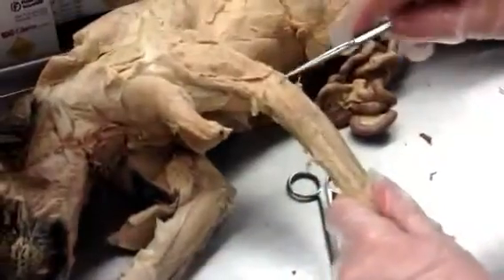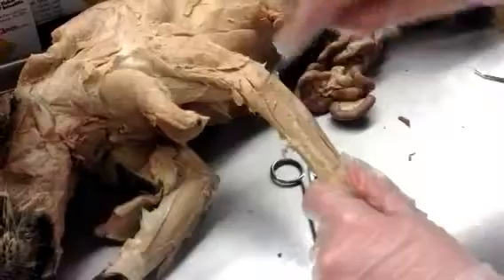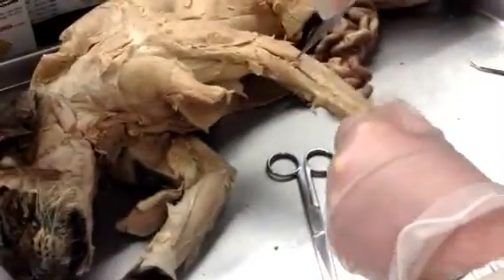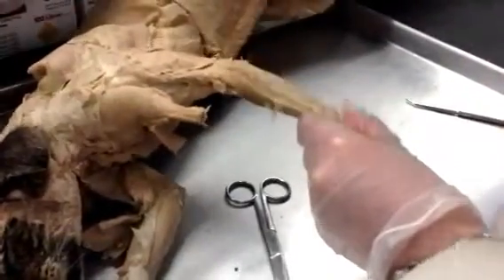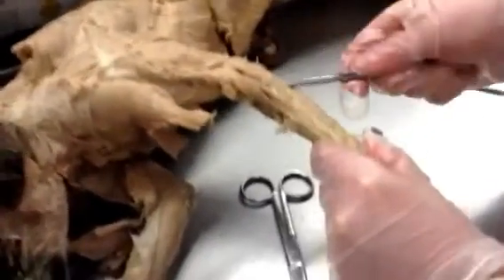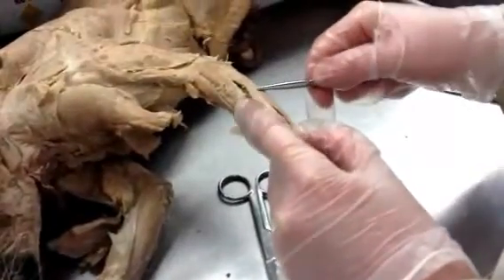Right here it's cut off, so let's assume this is number one: brachioradialis, number one; extensor carpi radialis longus, number two; extensor carpi radialis brevis — let me turn on more light. So: extensor carpi radialis longus, number one; extensor carpi radialis brevis, number two; extensor digitorum communis, number three.